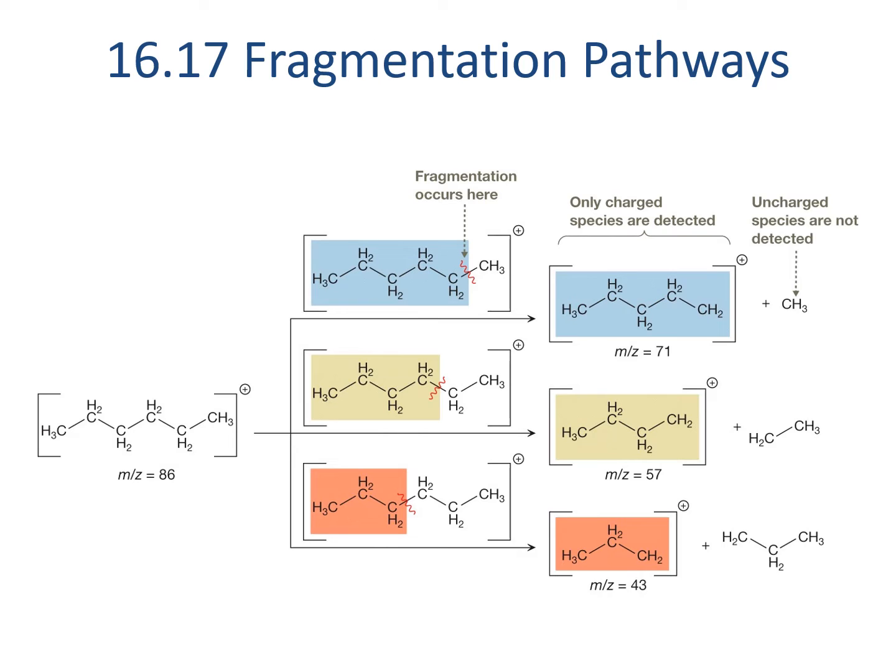When we form a positively charged radical ion, those electrons are usually stripped off from the highest energy orbitals, which in this case are actually the sigma bonding orbitals between any carbons. Depending on which carbon we are ejecting an electron from, we end up with a number of different possible fragments that can be formed. So if we eject an electron from this site, we can end up splitting that into a carbocation that is not a radical but just still has a positive charge, and an uncharged radical. The dots for the radical aren't written here, but this one is uncharged because it has a single electron.